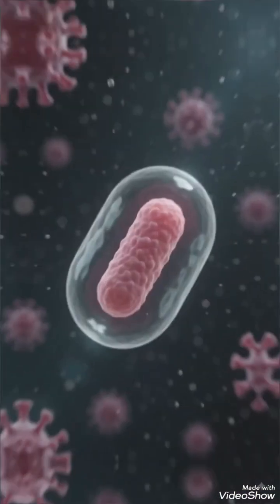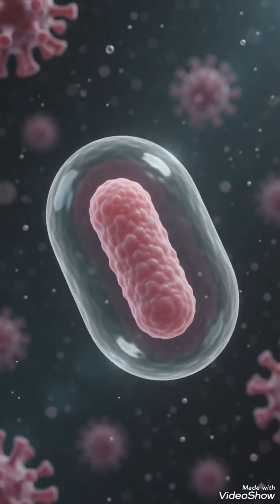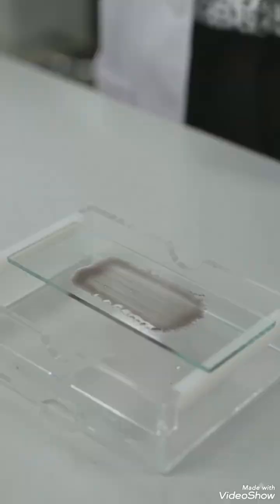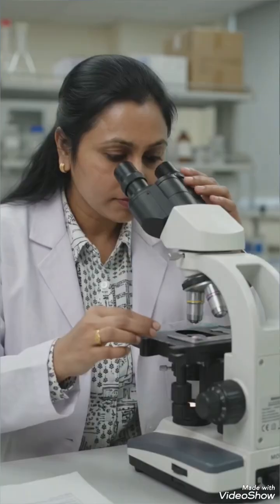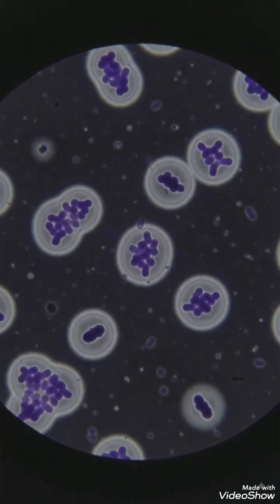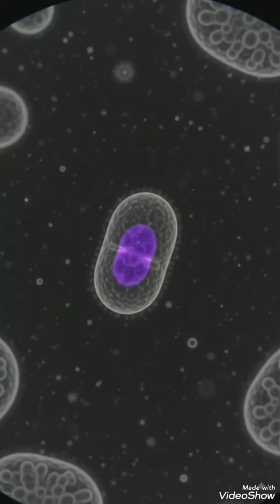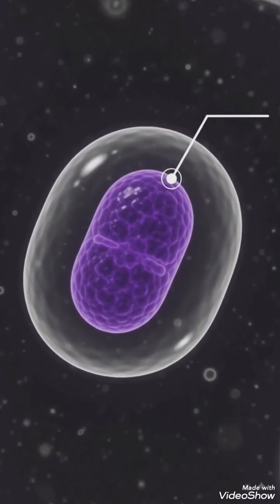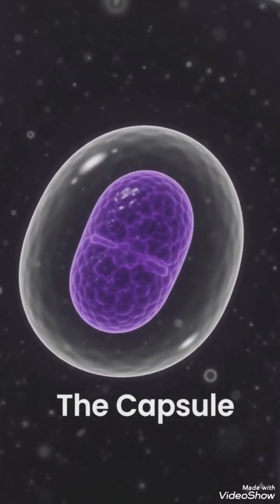Capsules are gelatinous protective layers surrounding certain bacteria. Examples: Klebsiella pneumoniae and Streptococcus pneumoniae. Mix bacterial suspension with India ink. Spread thin smear. Air dry without heat fixation. Counterstain with crystal violet. Observe under microscope. Capsules do not absorb stains. The background becomes dark and the bacterial cell stains purple, leaving a clear halo representing the capsule.